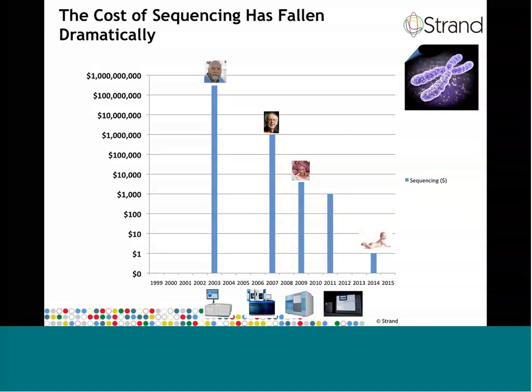Today, the cost of sequencing a complete human genome to an average of, say, 40x can be as low as $20,000. And many industry analysts have predicted that the cost will drop to a mere few $100s per genome in only a few years, making it feasible to start thinking about sequencing every human baby when they get born. These cost savings have been made possible by many technological innovations introduced by such companies as Applied Biosystems, Roche 454, Solexa Illumina, and more recently by companies such as Ion Torrent, Complete Genomics, and Pacific Biosciences.